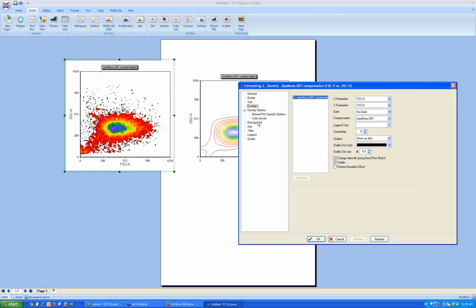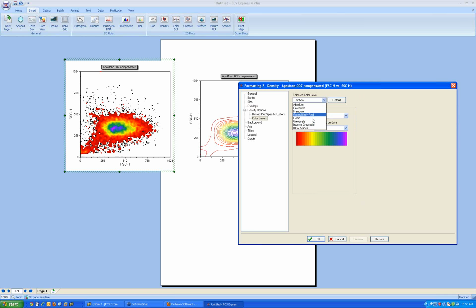And there's a lot of different palettes that you can use. I particularly like this black and white stripes palette. That looks pretty nice. And some other palettes. We have our flame palette that uses the colors of a flame, where red is the hottest and blue is the coldest. So we've really improved those.